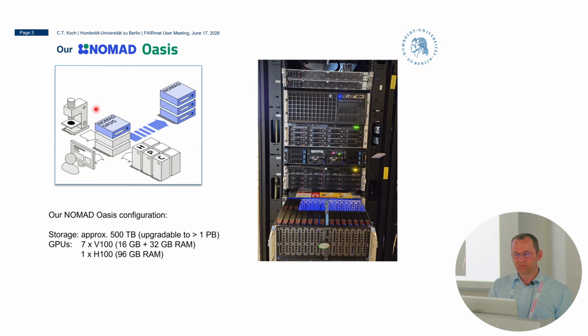But really our system is prototypical for exactly this setup that you can find on the website for NOMAD Oasis. The users interact with the NOMAD Oasis. The instruments upload their data directly to the NOMAD Oasis. There is a service that runs once a night, and of course, if you want to have it earlier, you can start this upload manually. But the data is uploaded automatically from the microscope to the NOMAD Oasis.